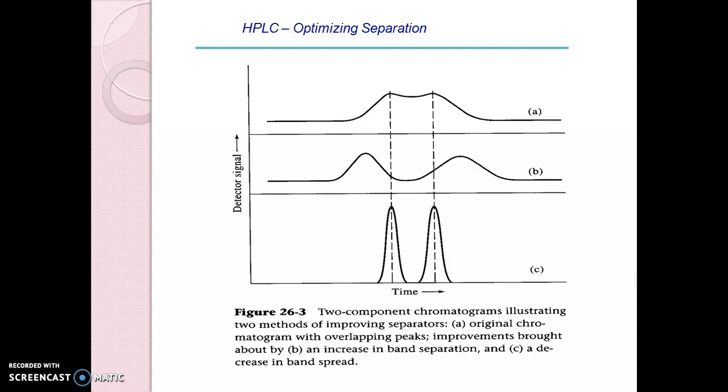HPLC chromatography technique is used in pharmaceutical industries for research and testing purposes. Most of the pharmaceutical companies follow a three-step approach to check the functioning of HPLC system, such as initial system qualification, method validation and system suitability testing.